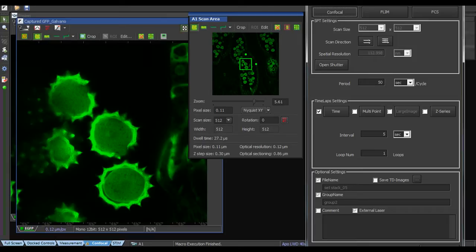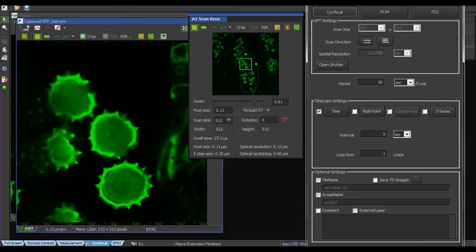It's for example now possible to make Z stack of FLIM and acquire them with the SymPhoTime and then transfer them back to the NIST and do the analysis with them.